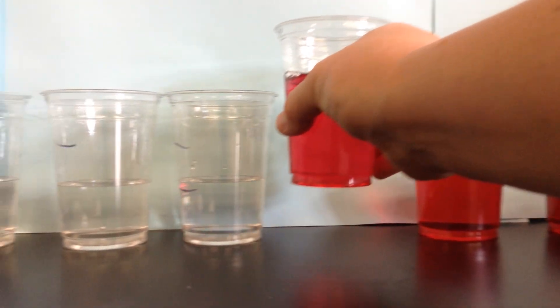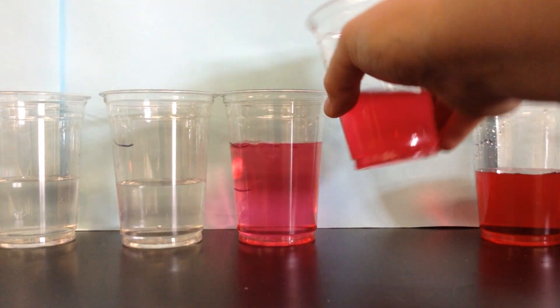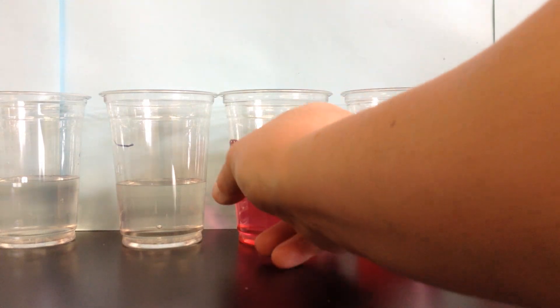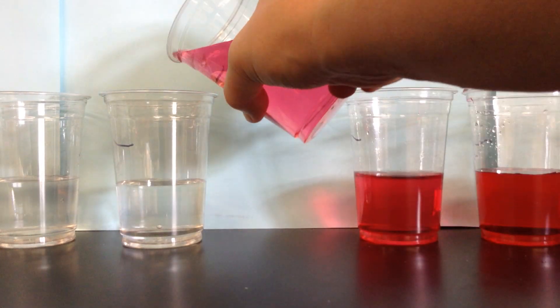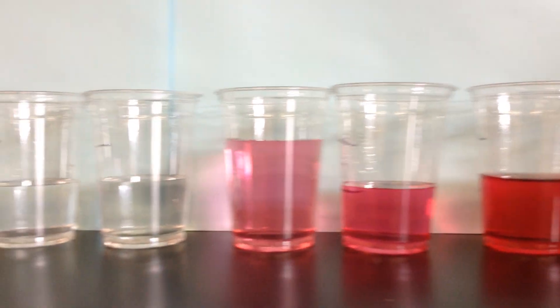And we keep going — 1/16th. And then we dilute it in half again. So think about your math — what would this one be? And we take it again.